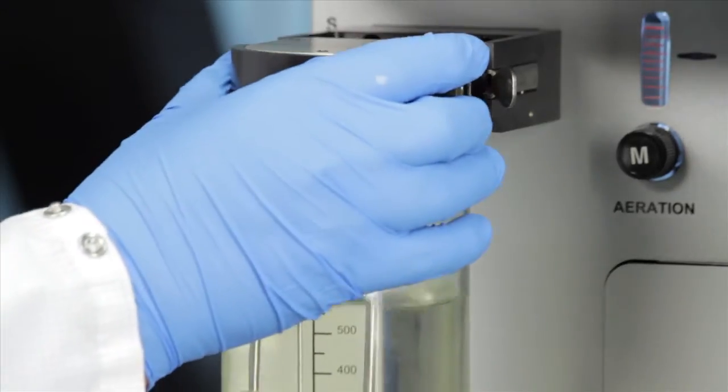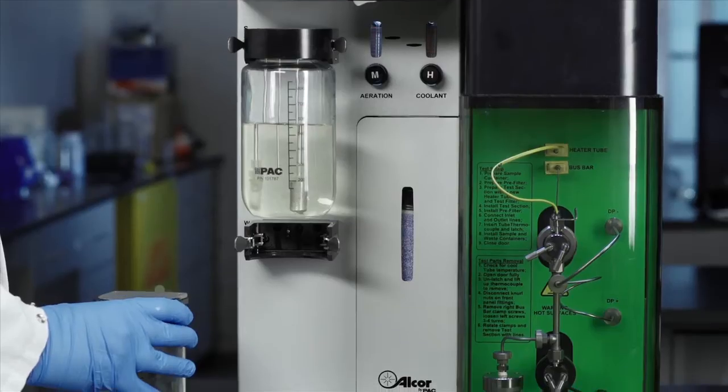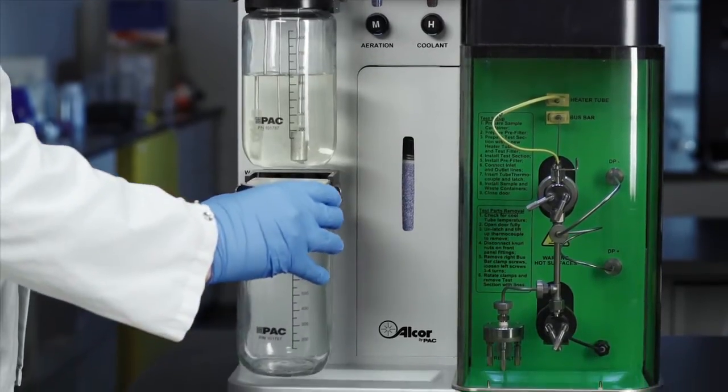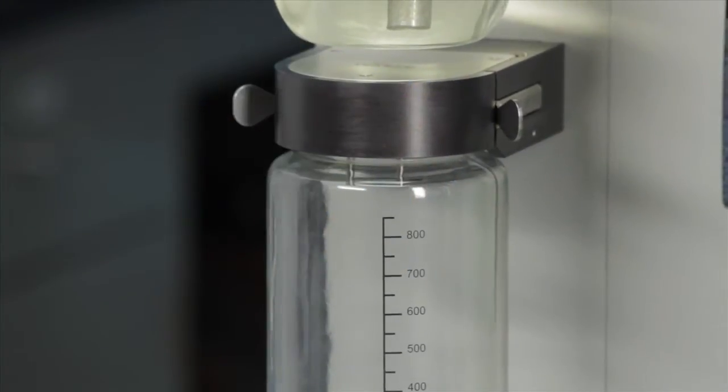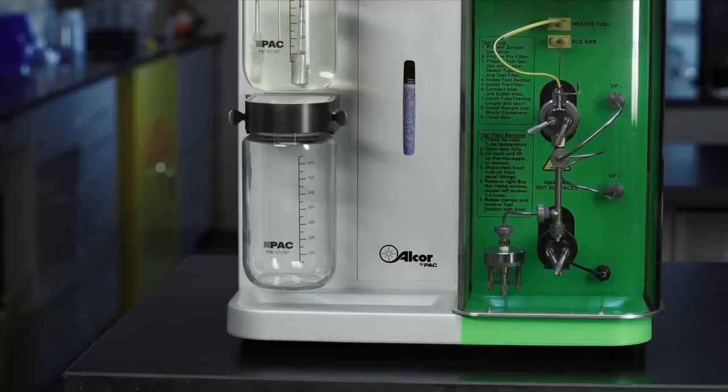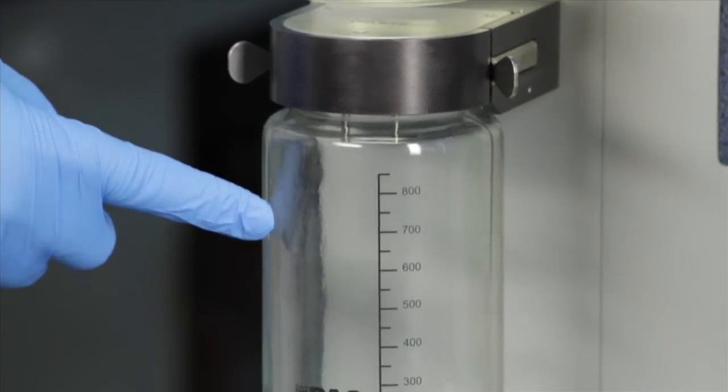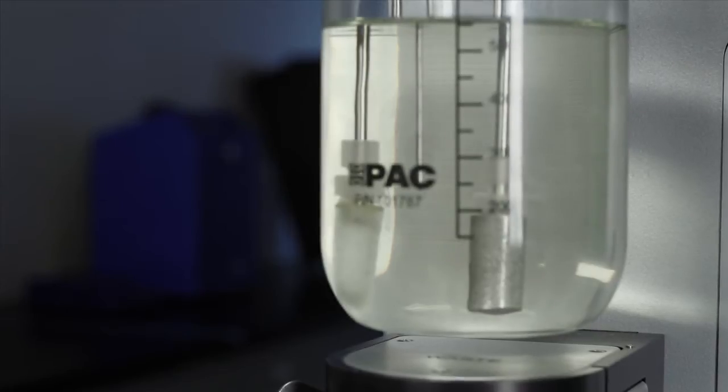The Jephtot 4 is safer to operate than any other Jet Fuel Thermal Oxidation Testing Instrument on the market. We've designed the sample and waste containers to minimize Jet Fuel Vapor Exposure to operators and to the environment, and we've added a special coating to the jars so they don't shatter if dropped or damaged.